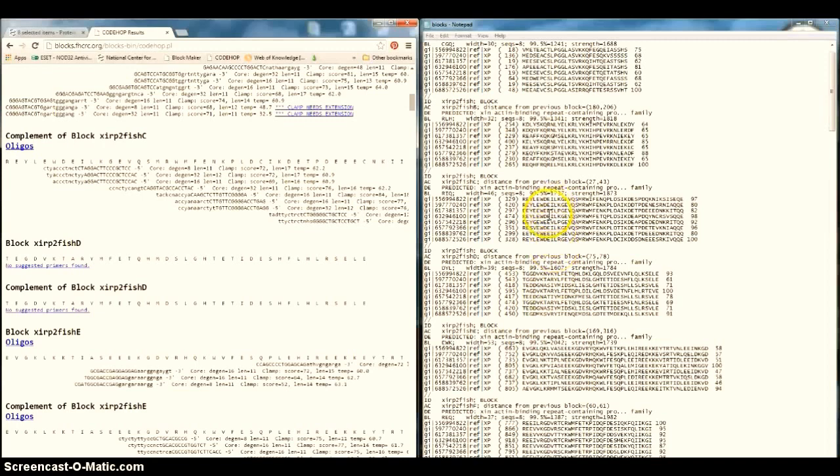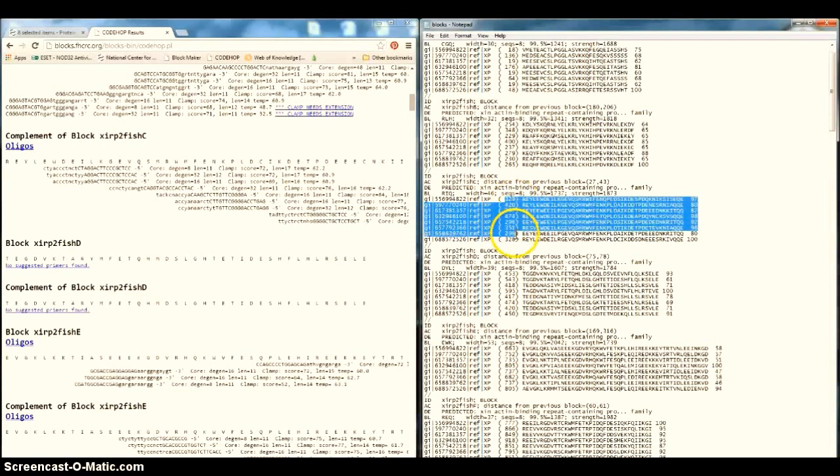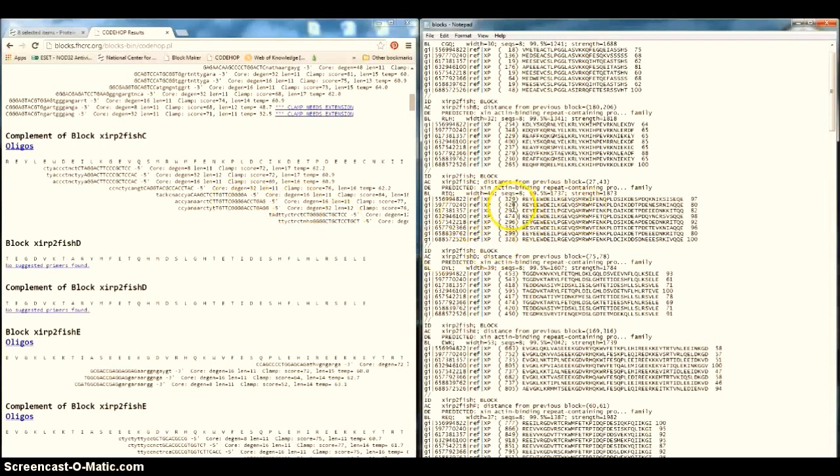So here, for example, I want 100 base pair, no, 1000 base pair, and if I choose block C, it's around 300 and something, the average should be 320 or something.